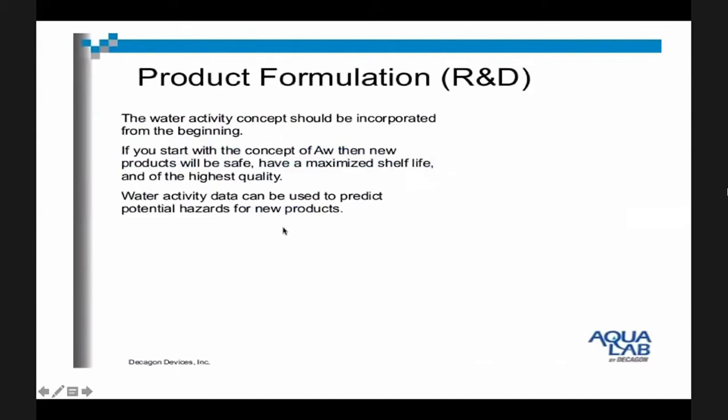Okay. For product formulation, the water activity concept should be incorporated from the beginning. It can be used to predict potential hazards for a new product. So during your product formulation, taking into account the important parameter, which is water activity, your new products will be safe, have a maximized shelf life, and be of the highest quality.